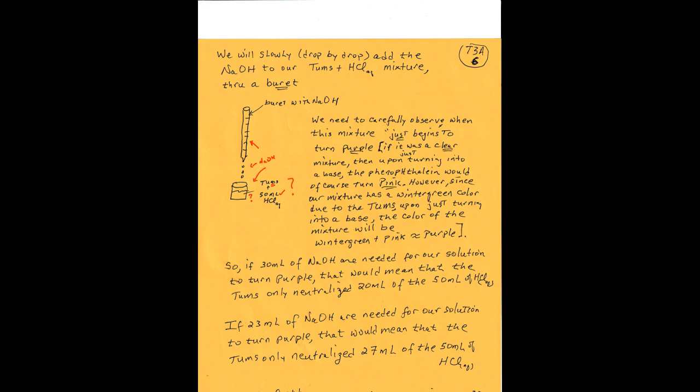were neutralized. Okay, I can't read the bottom, so we'll go on. I think that's pretty much it. That's what we're doing in the lab. We're going to try to neutralize, see how much of the HCl was neutralized by the NaOH. And however much NaOH you need, that means the Tums did not neutralize that. Let me just say a couple words about concentration of solution.